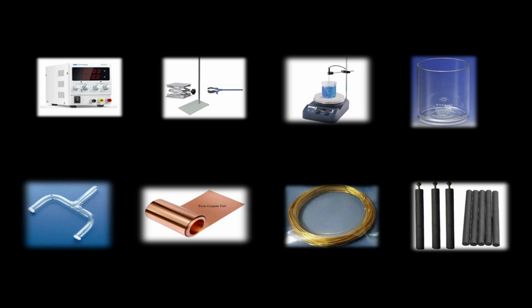Now these may be purchased with terminals attached for easy connectivity or without. Clamps will be required. Now these electrodes may be any other metallic rod as long as they do not interact with the solution, resulting in unwanted reactions. My choice would be to purchase a silver-silver chloride electrode or calomel electrode as a reference electrode, allowing for better precision and efficiency.